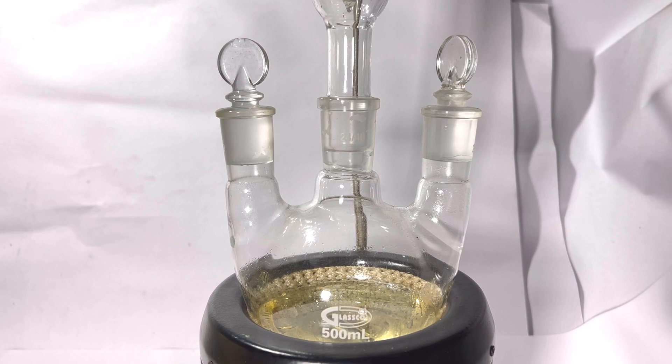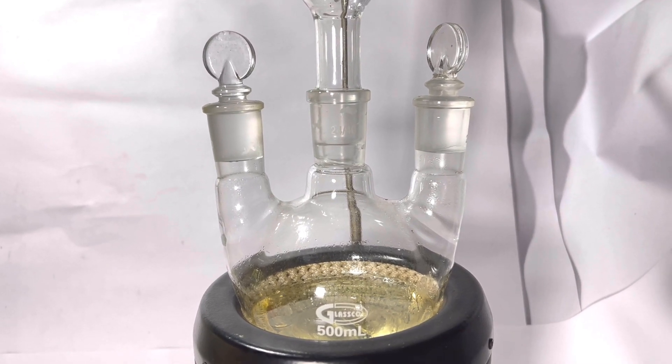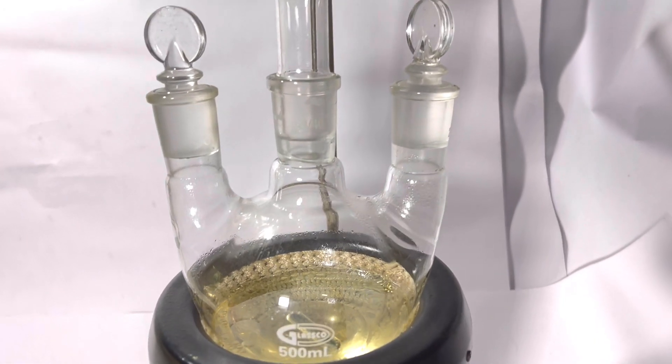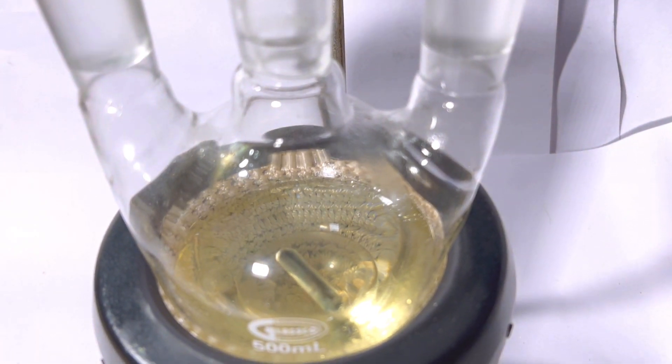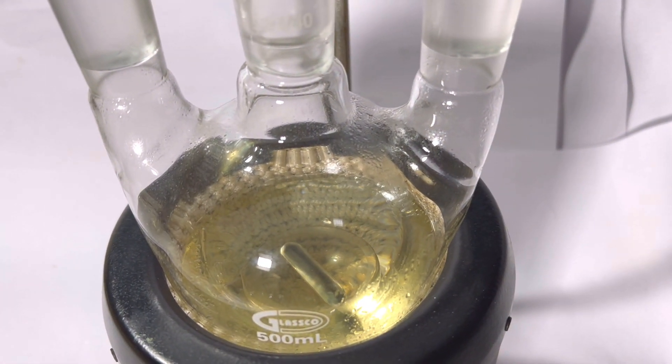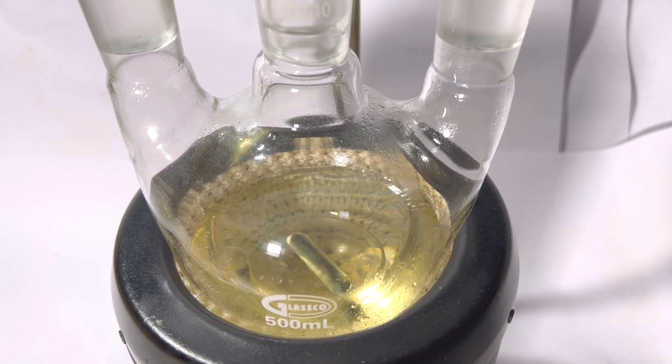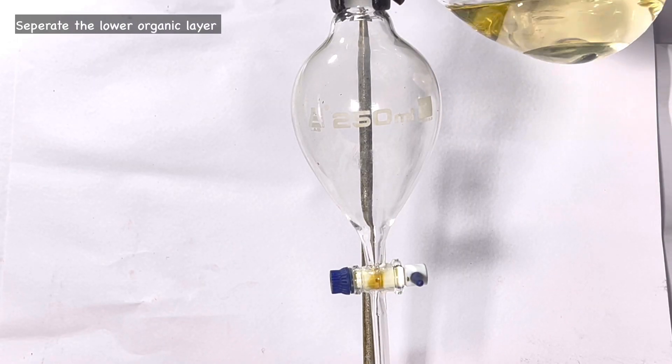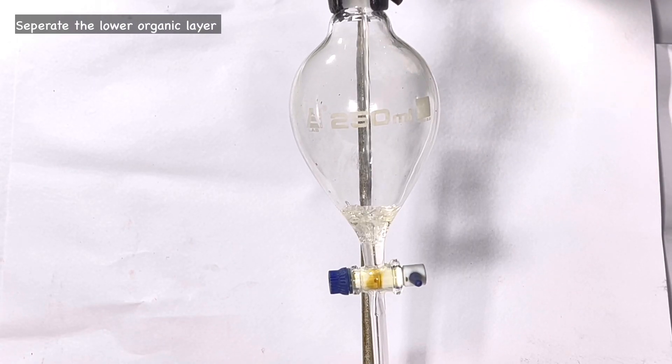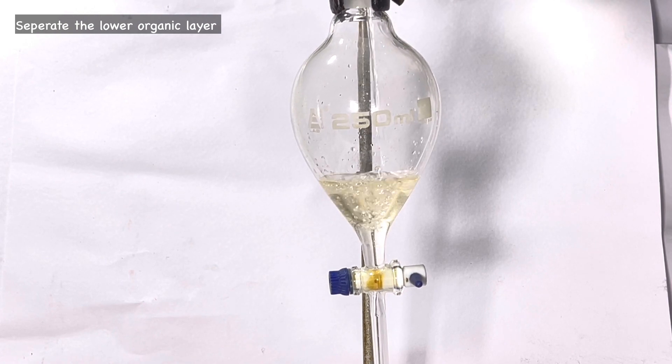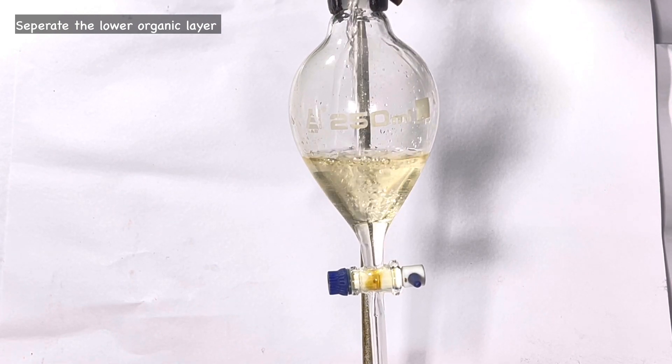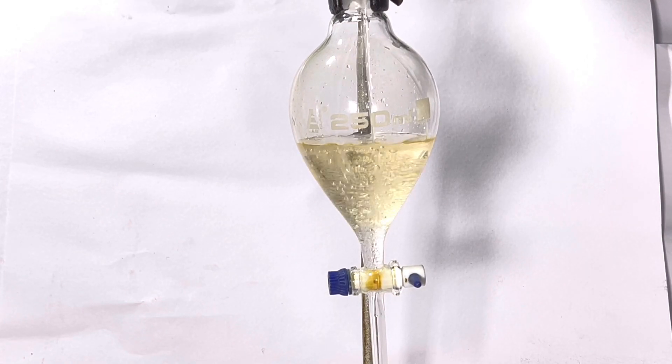After 5 hours of reflux, it was stopped and contents of the flask was allowed to cool down to room temperature. You can already see the layers here getting separated. Next the contents of the flask was transferred to a separatory funnel. The bulky dibromobutane layer collects at the bottom and the aqueous layer on top. The lower dibromobutane was then collected.